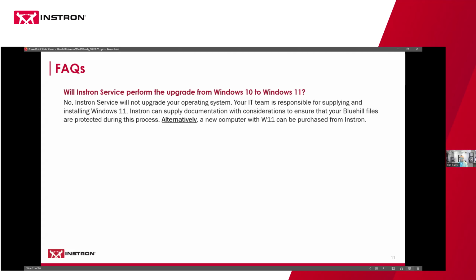So the first is, will Instron Service perform the upgrade from Windows 10 to Windows 11? I've already mentioned this, but the answer is no. Instron Service will not upgrade your existing operating system on your computer. Your IT team is responsible for supplying that new Windows 11 image and performing the installation. We have supplemental documentation that goes through some considerations during that process to ensure that your existing Bluehill files are protected.